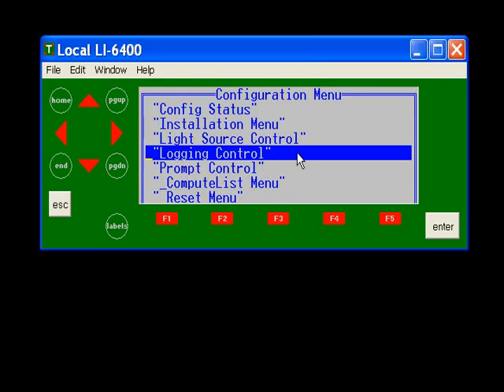There are a number of items that we put in the log list by default, and many of those items are needed if you want to recompute your data. But if you're trying to save space and memory, you can go into that list and edit it and delete items or add to them as you wish.